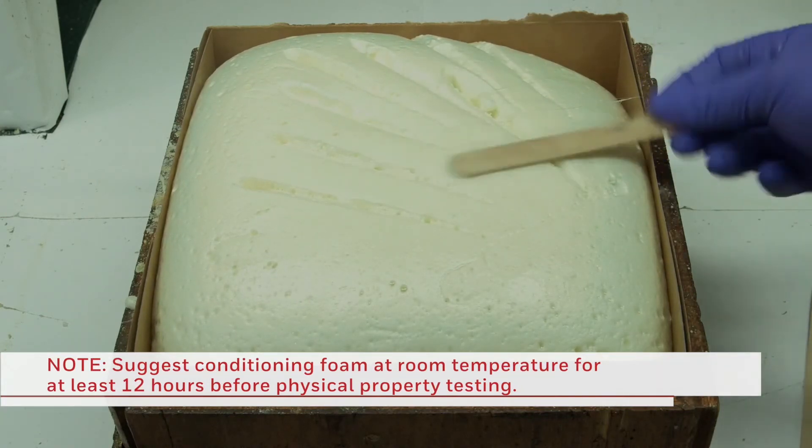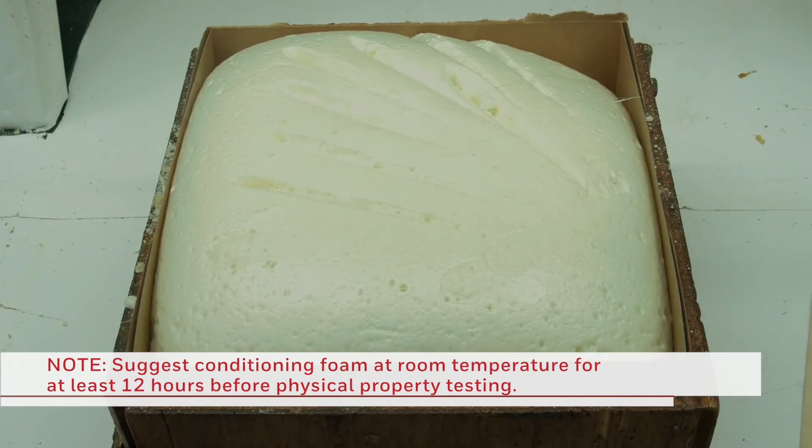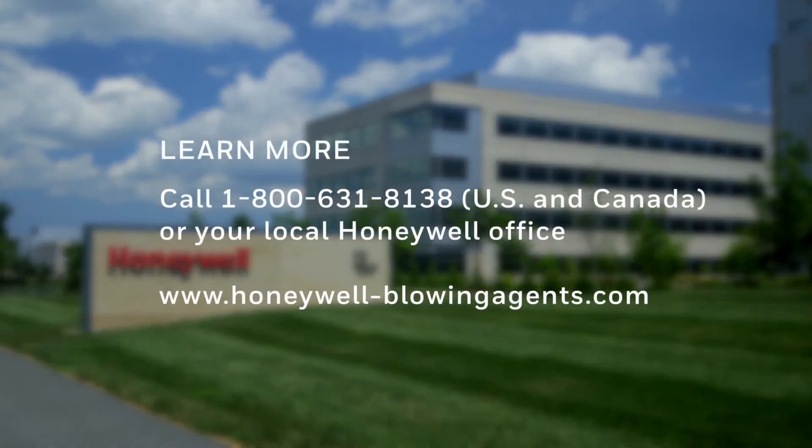It is suggested that the foam be conditioned at room temperature for at least 12 hours before it is cut for physical property testing. If you have any questions about Honeywell blowing agents or this process, please contact your Honeywell representative.